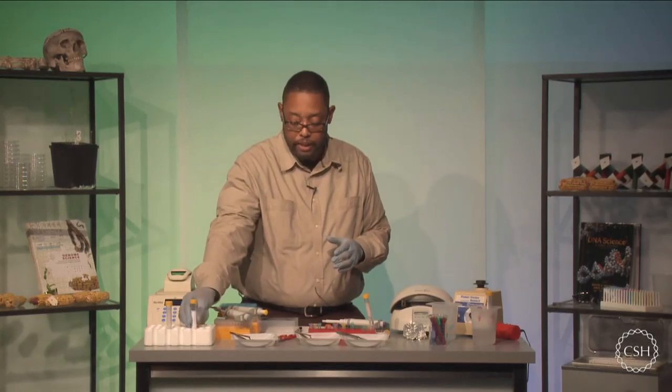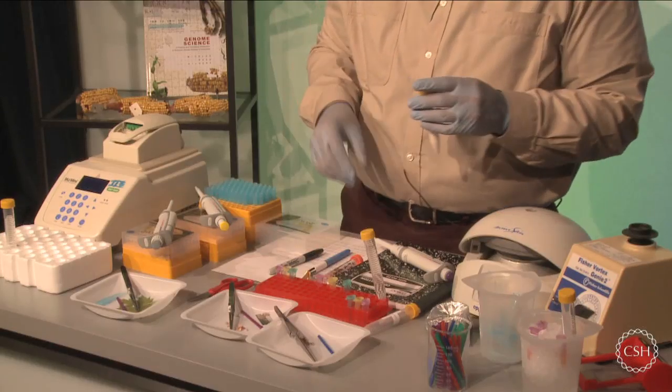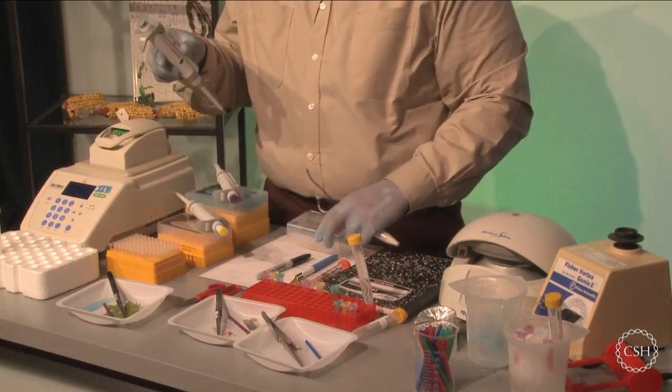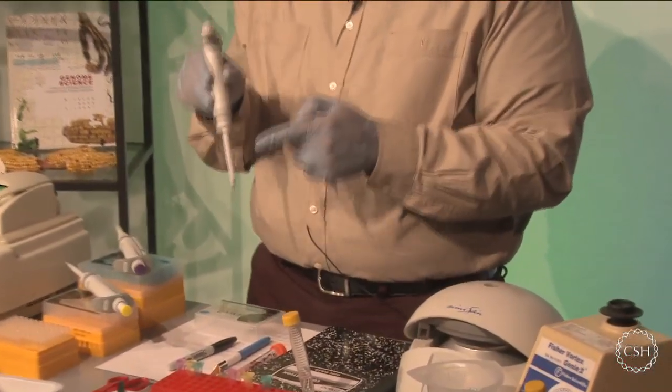I'm going to bind all that DNA up by adding my silica resin. So I'm going to take the silica resin at this moment, and I'm only going to use 3 microliters of it. So now I'm going to need to shift over to my P10, which is already set to 3 microliters. And I'm going to add 3 microliters of silica resin to each sample.